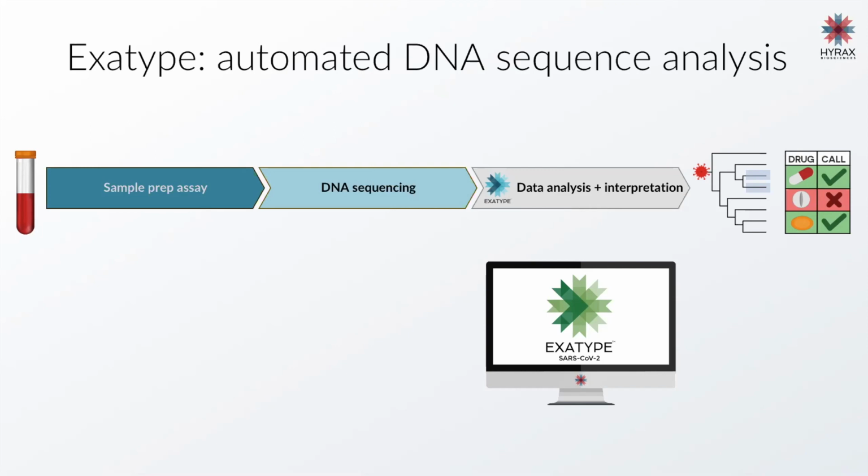So we're already doing this with a number of customers. We have solutions out there in the marketplace whereby the customers are automatically integrating their sequencing machines directly with Exatype, pushing the data through, the analysis happens, and the results are presented for them to populate the LIMS. So essentially, it's a completely hands-off solution whereby end users don't need to interact with it. That's the ultimate goal of the software, but we have various grades of the software in terms of the amount of interaction that you want or need to have with it.